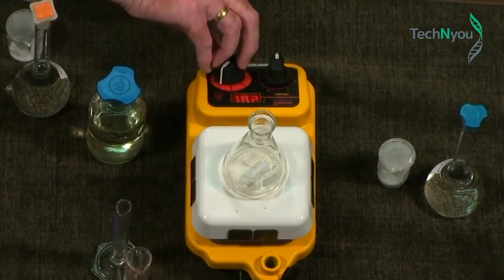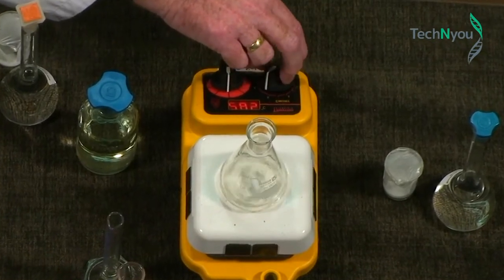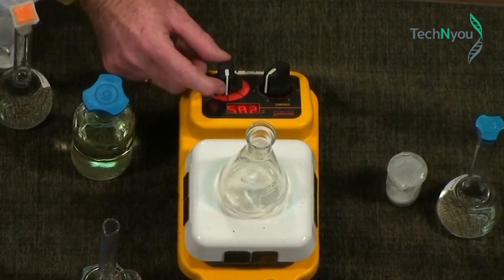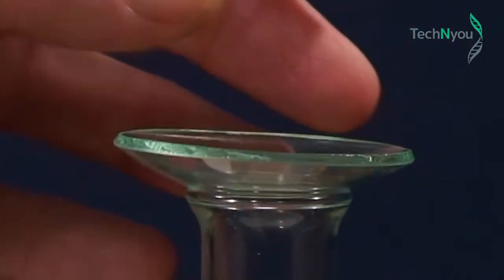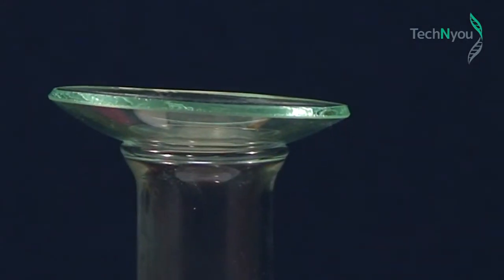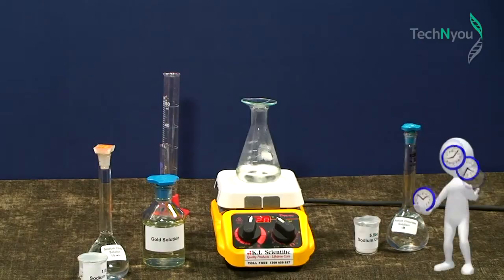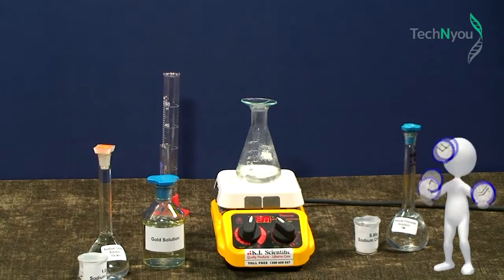We'll heat this solution until it boils, which usually takes 4 to 5 minutes. We will just keep it stirring to ensure it heats evenly. Please note the watch glass on top of the conical flask. It's there to prevent the solution evaporating as it heats. Once it boils, we'll remove the watch glass and add the citrate solution.